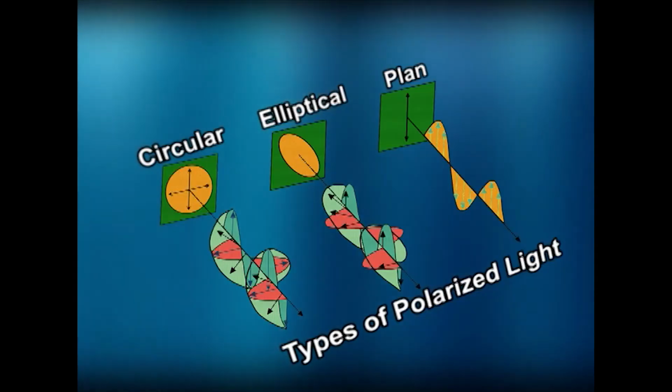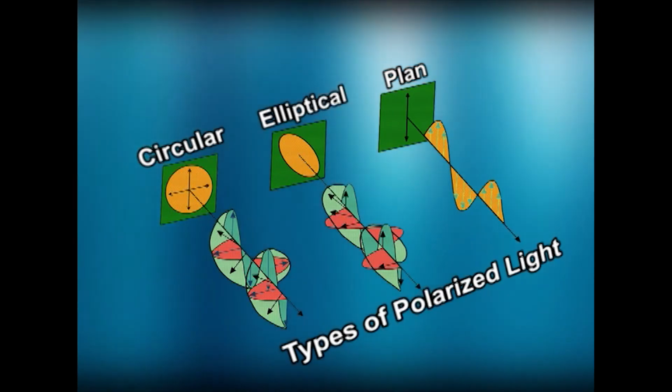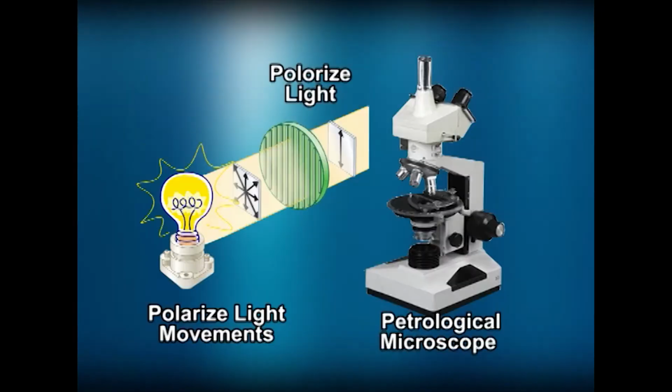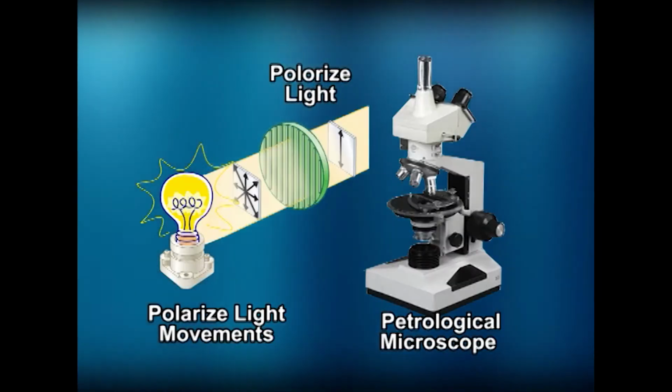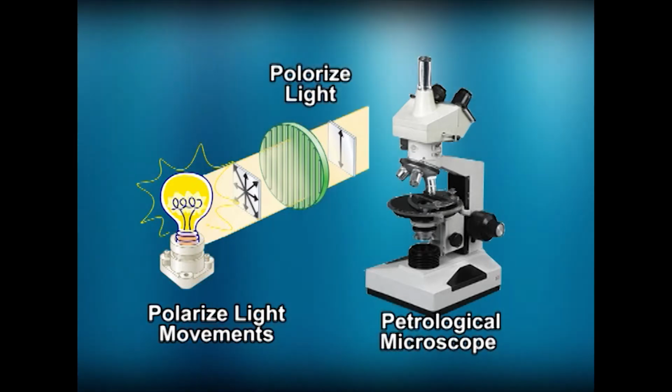The polarizer can be rotated through 360 degrees and can easily be slipped from its mount or swung from the light path. Ordinary light that is reflected by the mirror, on entering the polarizer, is converted into polarized light with vibrations confined to the shorter diagonal of the rhomboidal face of the polarizer, the vibration plane of the Nicol.